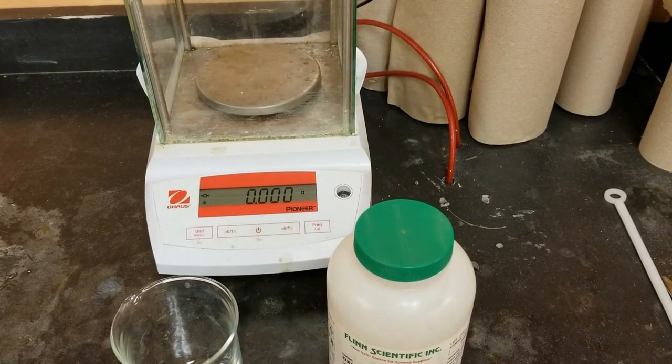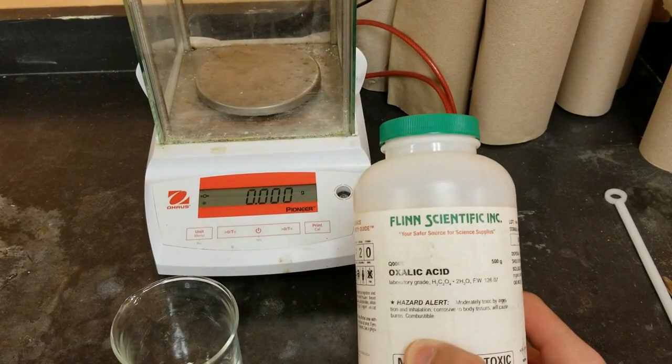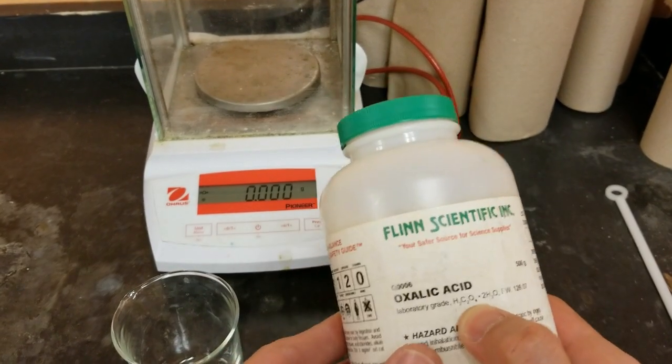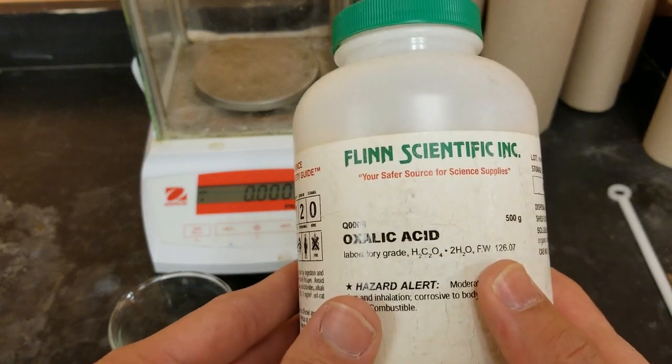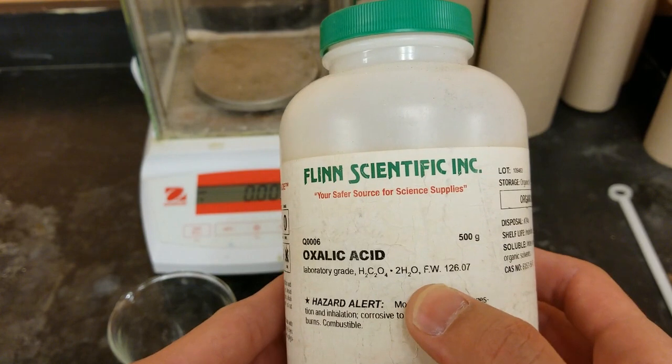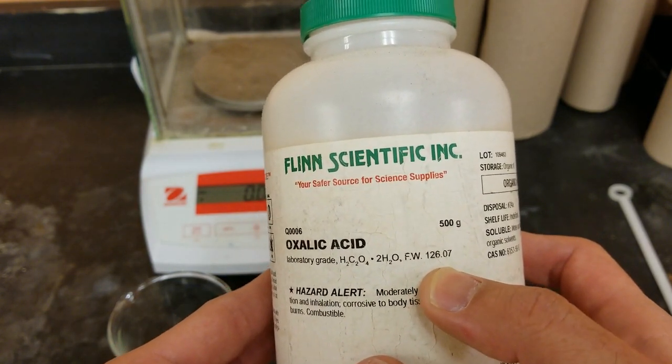The first thing that I'm going to be doing is measuring out some oxalic acid powder into this beaker. Oxalic acid has this formula: H2C2O4. It loses two hydrogens in reactions. Its formula weight or its molar mass is 126.07 grams per mole.